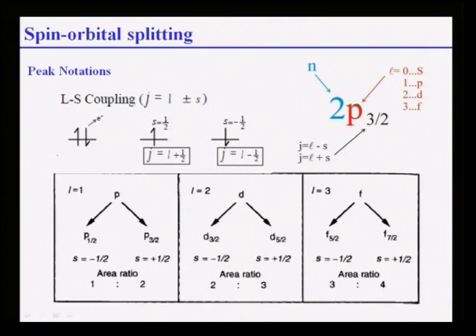Now let us look at what spin orbit splitting is. First, let me tell you how it is done. An electron has an up spin or down spin. It is plus half or minus half. So basically we use something known as LS coupling. We do not use only S. As you know, the principal quantum number n, l, s, all these things you are very aware of.